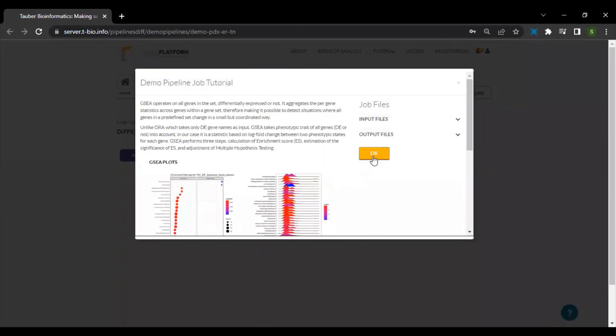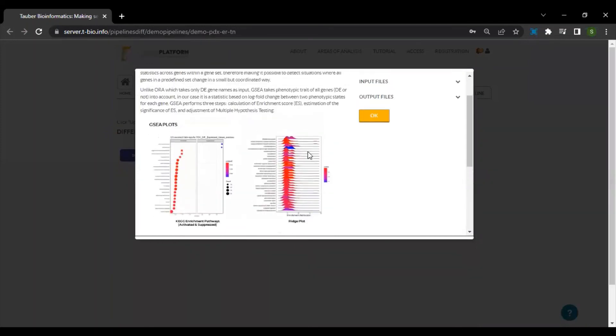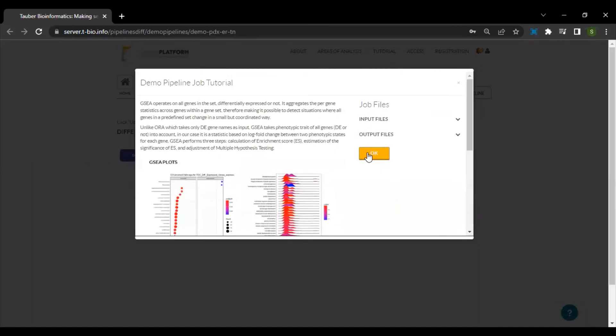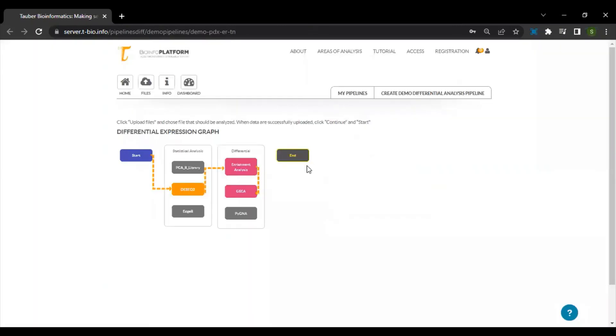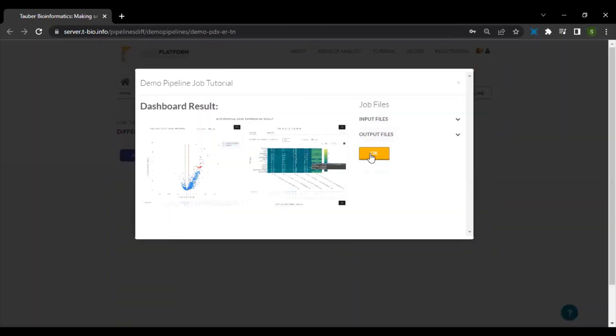Note that the description of each of the algorithms have been explained in the pop-ups that show when you click on each of the steps. Feel free to browse through and learn at your pace. Click on end to finish the pipeline.